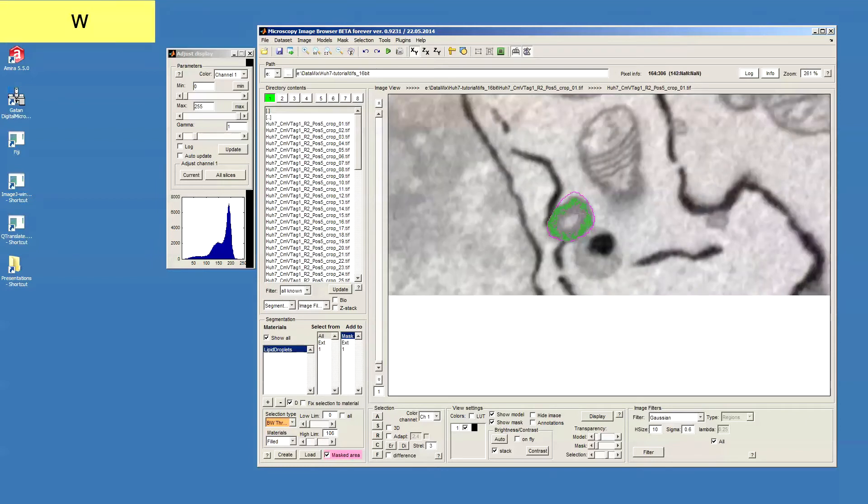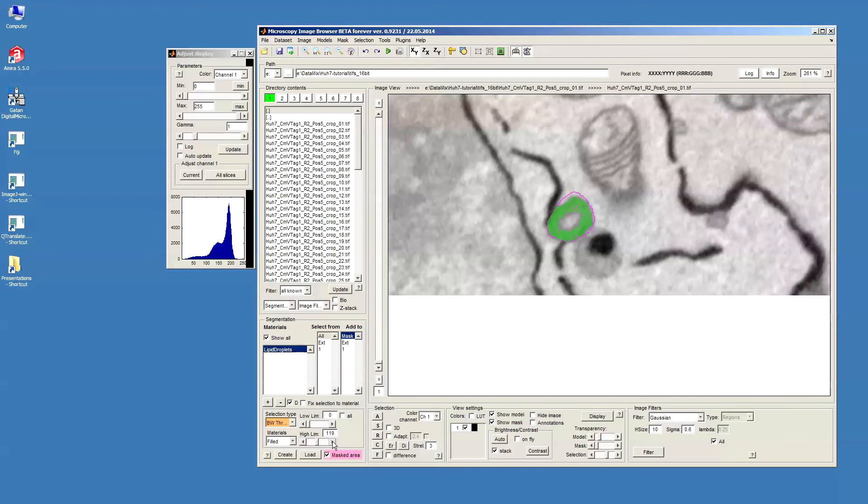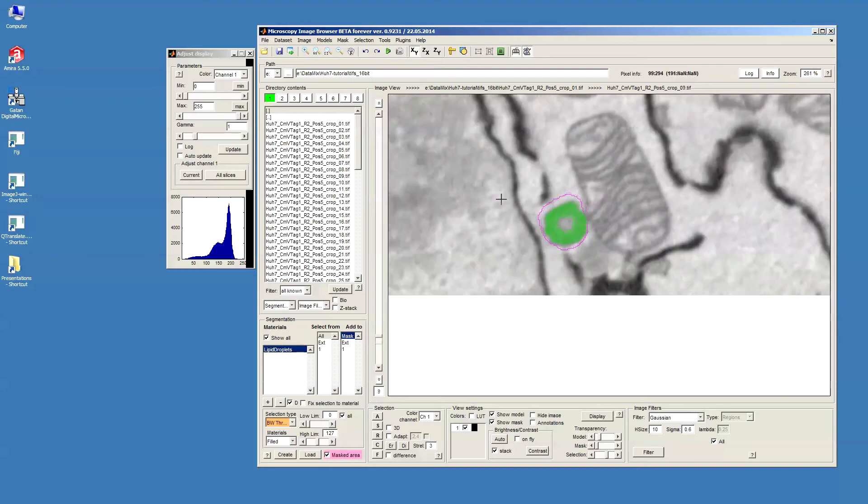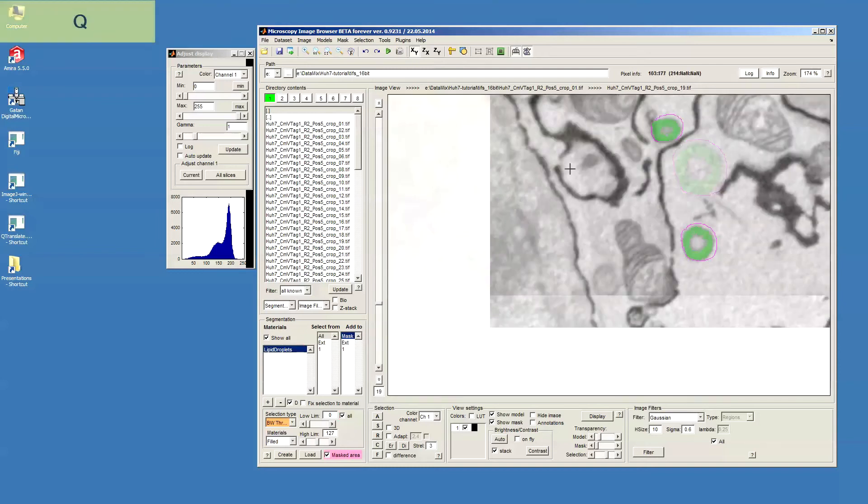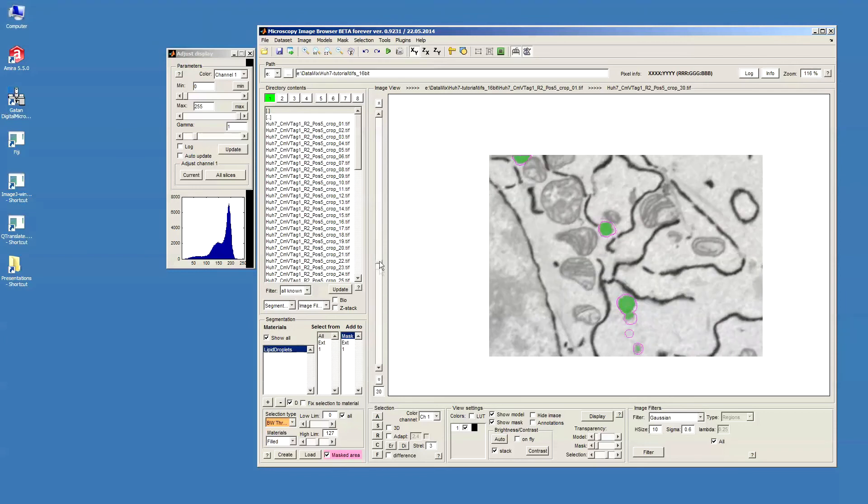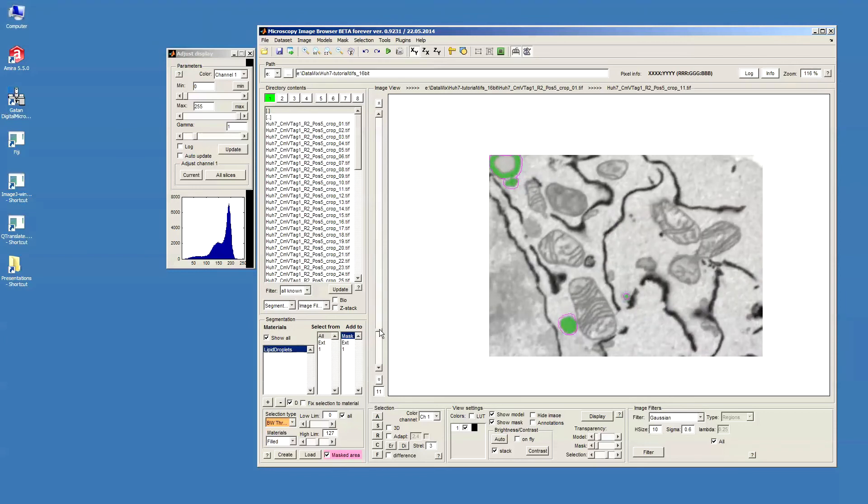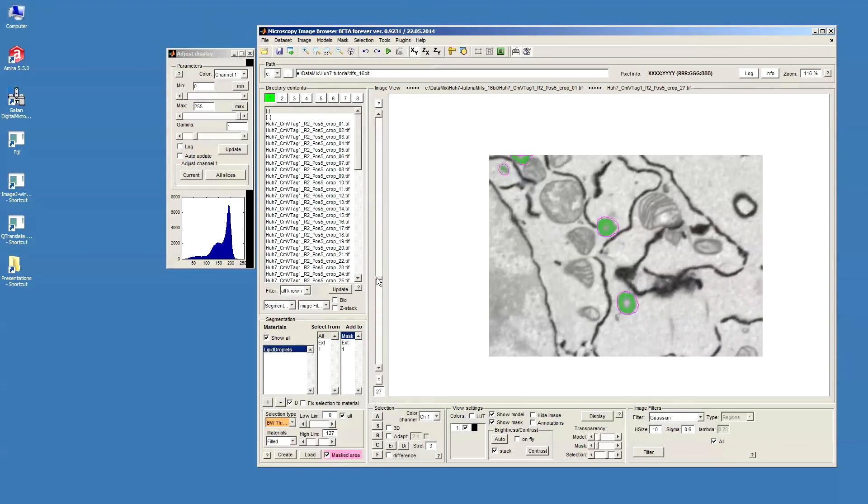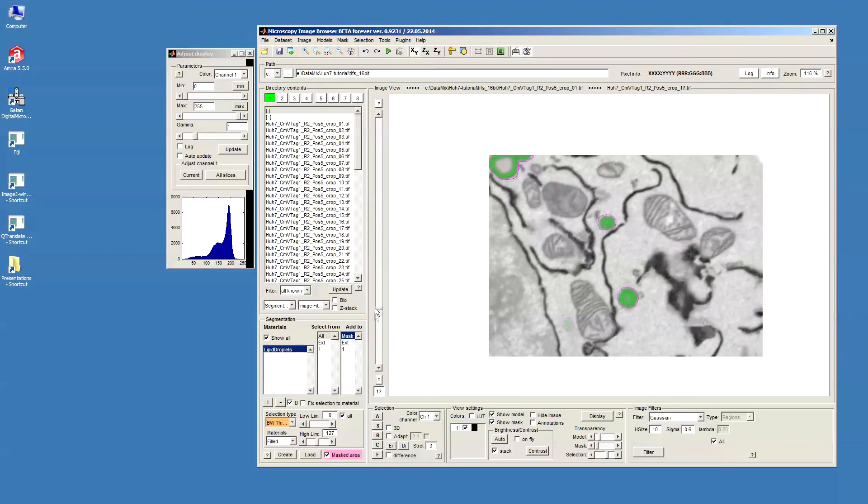So what I need to do is I just need to figure out the proper parameters for the thresholding. And then I will apply this for the whole image by pressing this all checkbox. Now if I will just go then you can see that all masked areas that I have in the dataset got segmented.